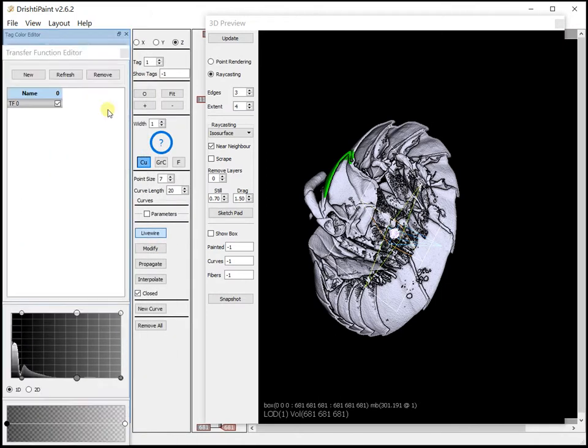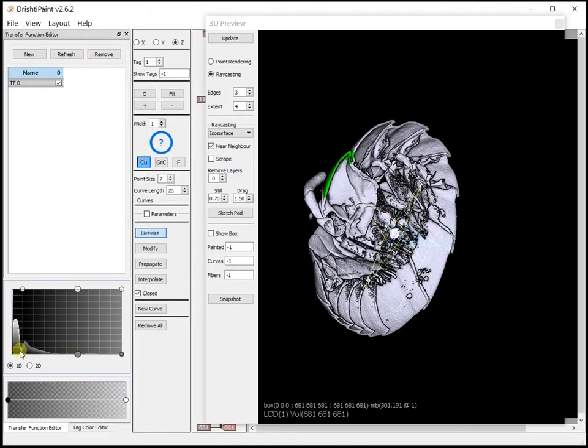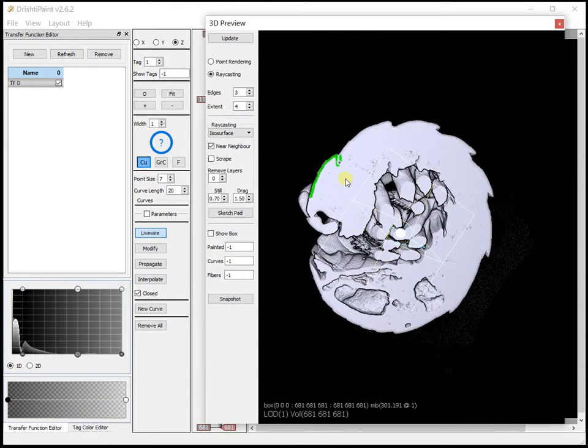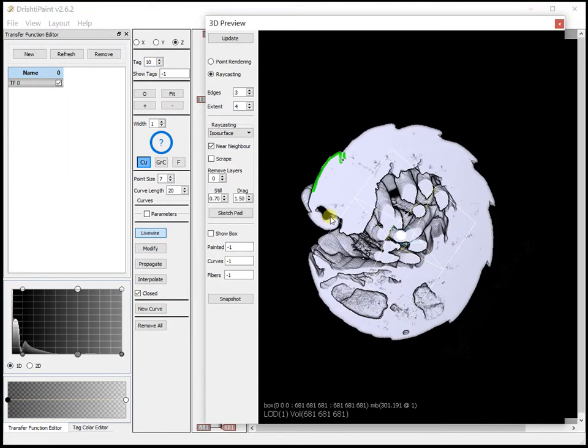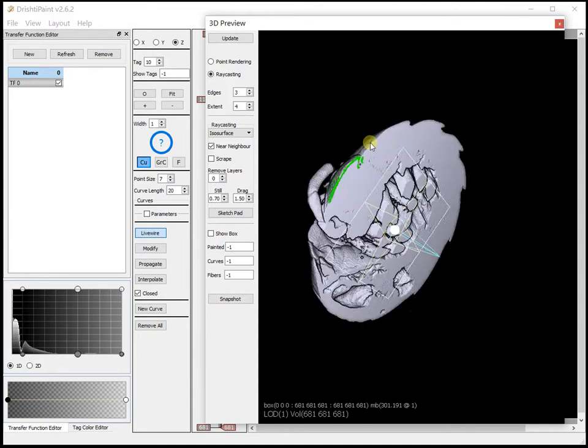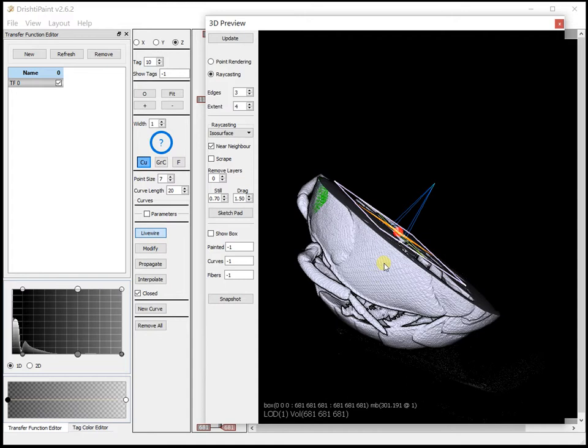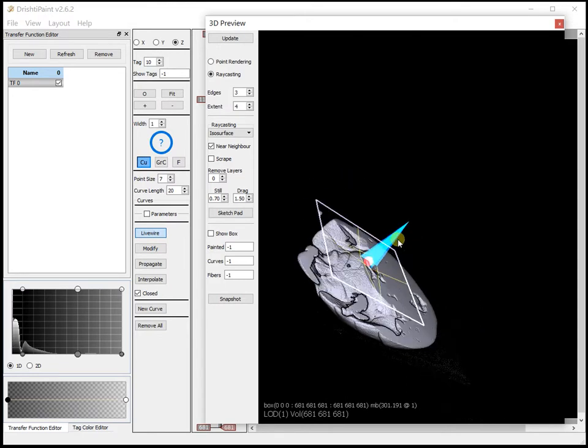Let me just put it here. Okay, so let me use a tag 10 to act as a barrier.